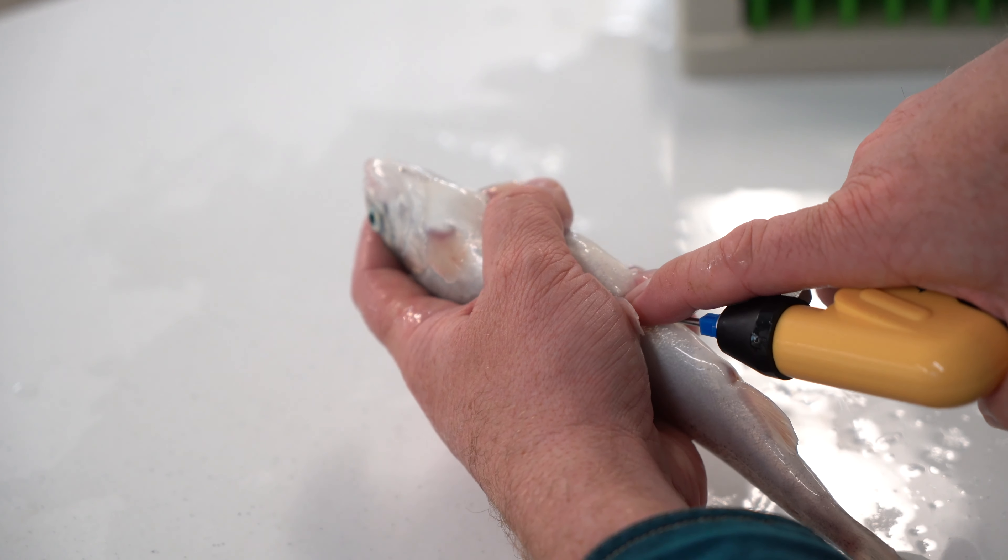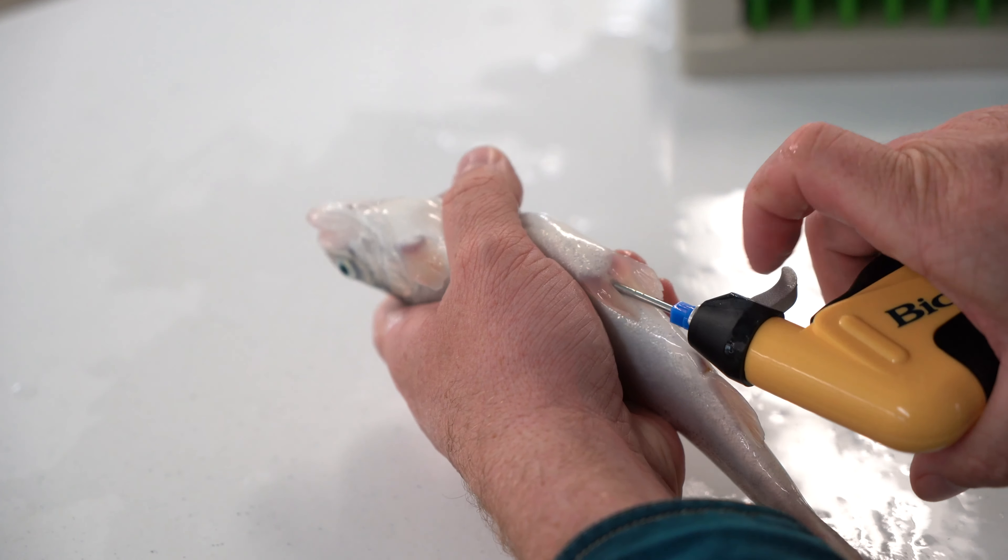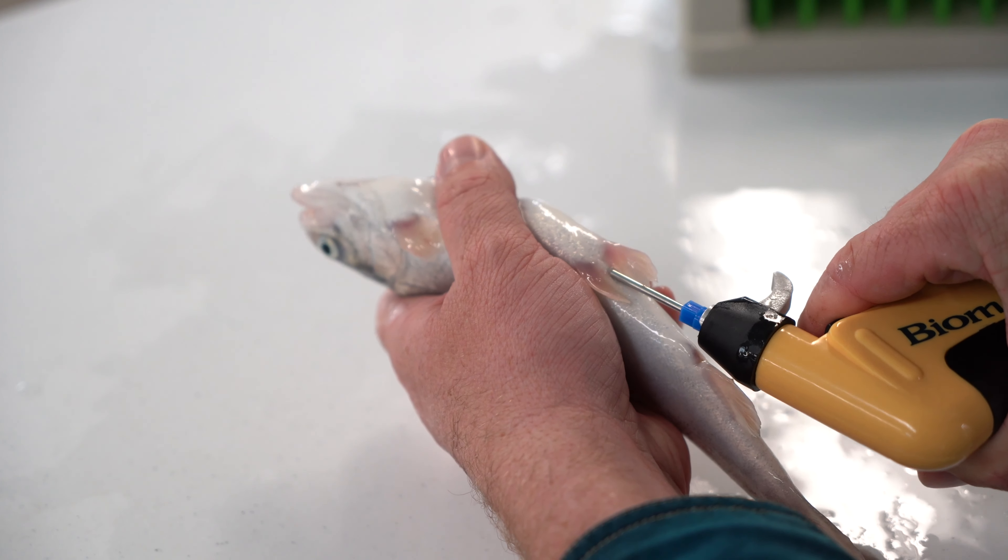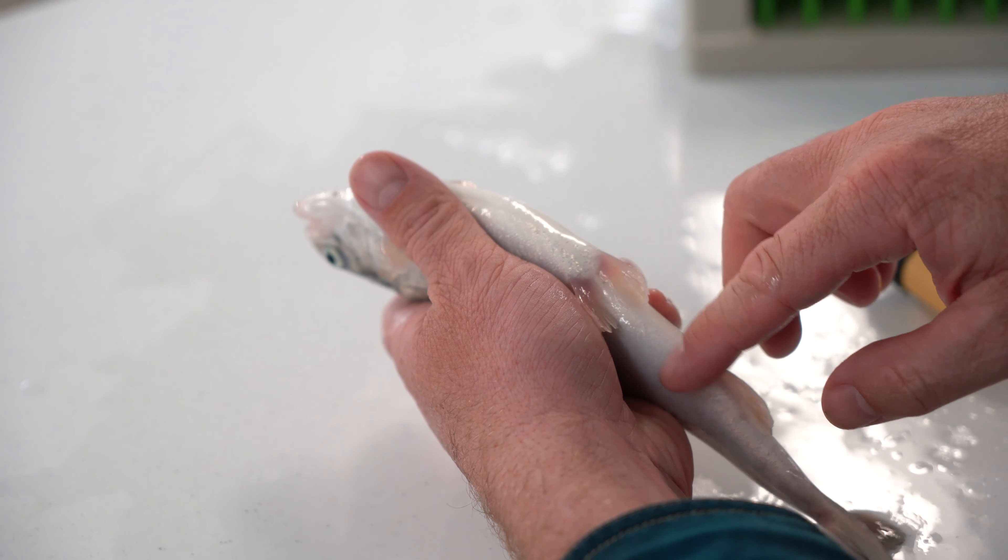After initial insertion, move the needle parallel to the body of the fish. The depth of needle penetration will typically vary between 1.5 and 2.5 centimeters depending on fish size.